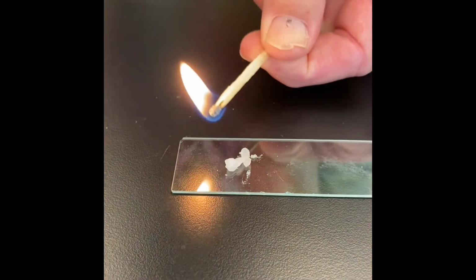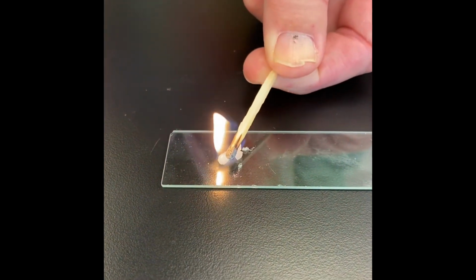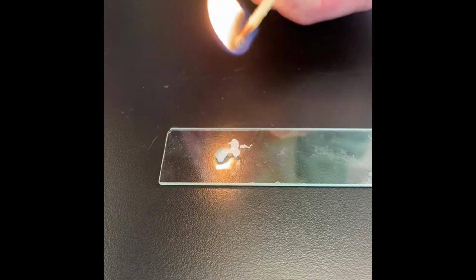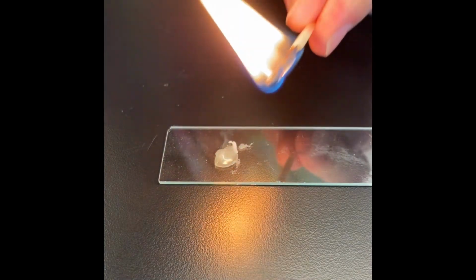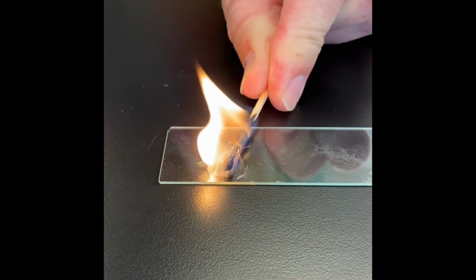Now, will that wax burn like it burned with the candle? Well, let's try it out. So I'm going to take a match and I'm going to try to just light the wax. It doesn't seem like it wants to burn.